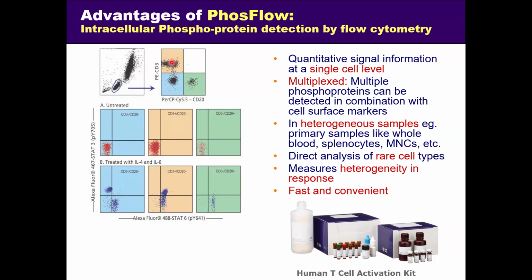If you see this one, this is your T cell, this is your B cell, and this is your negative population, which basically means your NK cell. So you are getting STAT6 activation in your T cells. Basically, this is untreated, this is treated. After treatment, you see there is an activation of cells, there is a phosphorylation of the STATs. Again, STAT is a protein inside the cell which gets phosphorylated, and once it gets phosphorylated, your cells get active. So this is what is happening here.